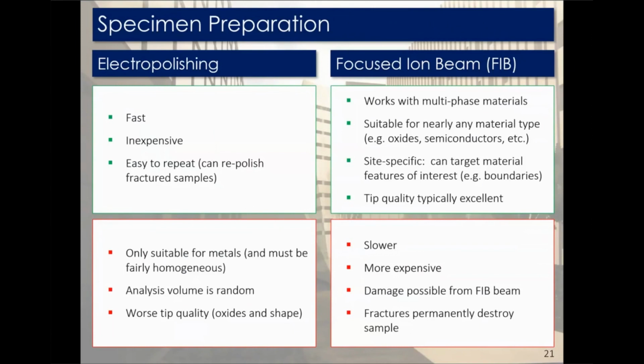If you have your electropolished sample in the atom probe, and you run the sample until it's blunt or fractured, and you want to repolish it using the microloop, it's very easy to form another fine point a few hundred microns back from the original point. And given that with atom probe you're only evaporating a few hundred nanometers of material, moving a few hundred microns away on your electropolished sample is almost like taking an entirely different sample. So it's easy if you want to get a lot of repeats, or do systematic analysis with a lot of different conditions.